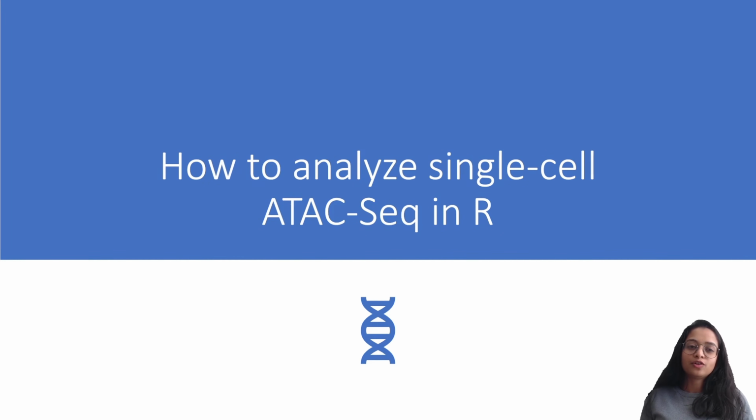So today we are going to talk about analyzing single cell ATAC-Seq data, and in this video I'm going to talk about what is ATAC-Seq, the difference between bulk and single cell ATAC-Seq, the analysis and pre-processing steps for ATAC-Seq, and finally we'll be demonstrating how to analyze such a data set in R.